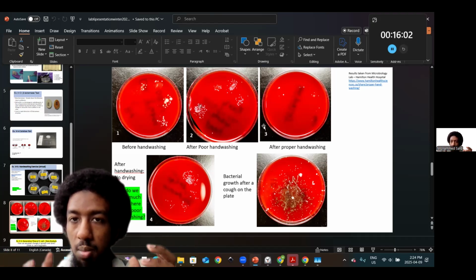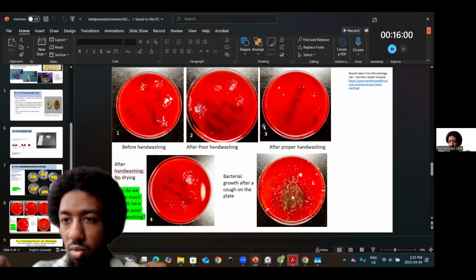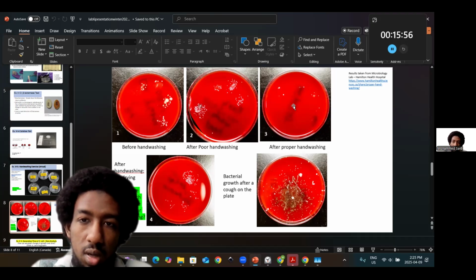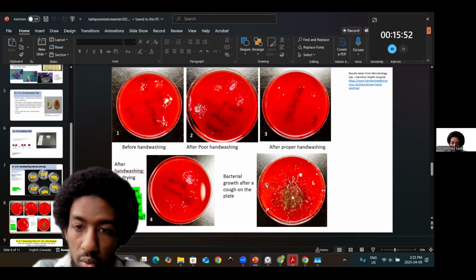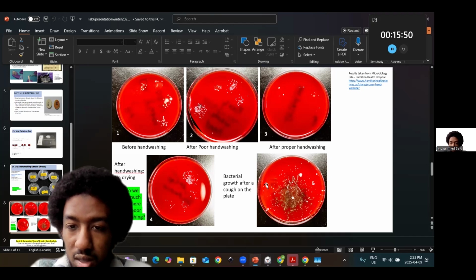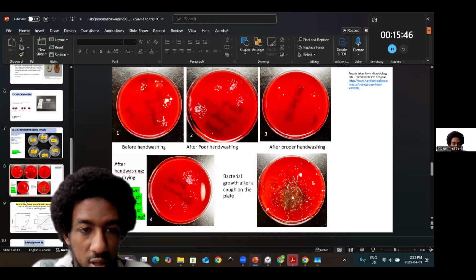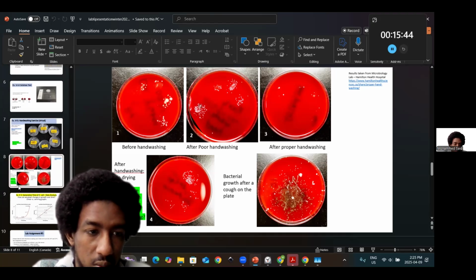Pathogens that are essentially bacteria that pose a level of harm to the body or to others, right? Not all bacteria are harmful, indeed, but nonetheless, you could see how a difference in bacterial growth, morphology, shape, and size exists across the different conditions. And so that's something that you want to bear in mind.